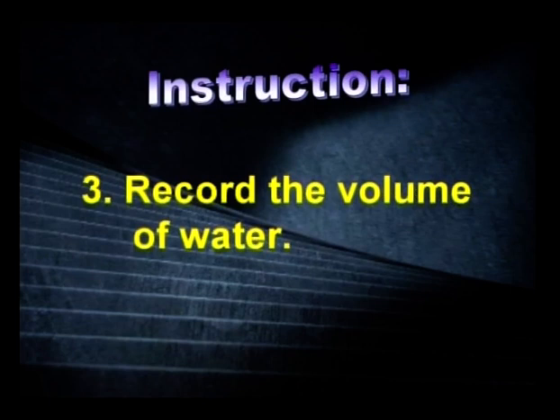Instruction number 3 is record volume of water. Okay, did you record the volume of water? Did you write it down somewhere? Okay, write it down somewhere. Volume of water.